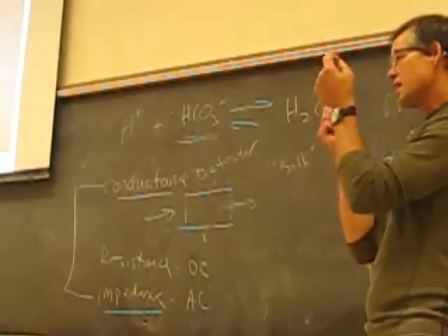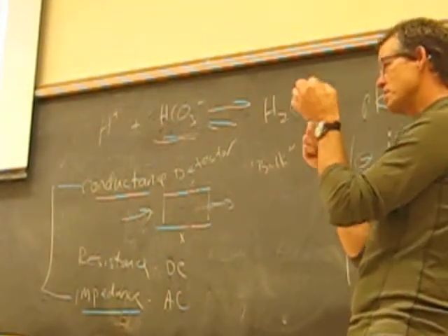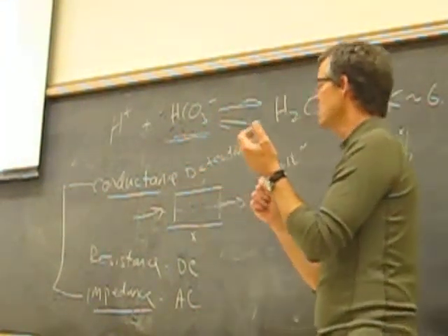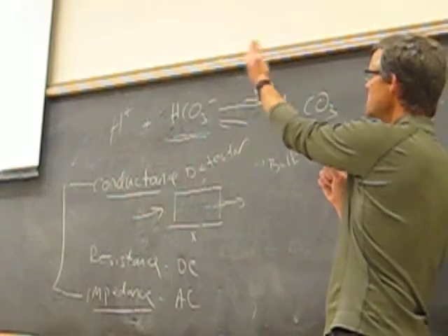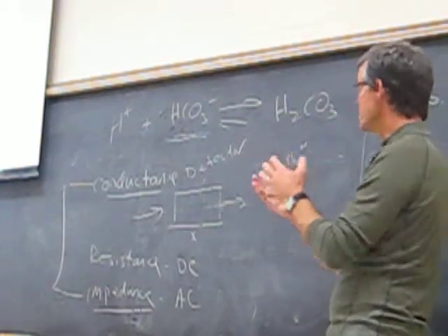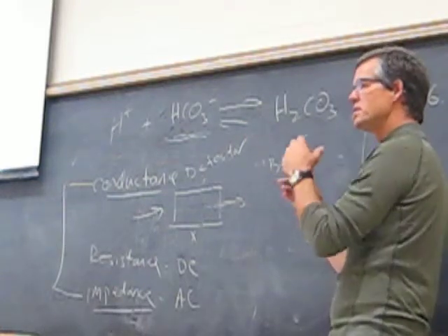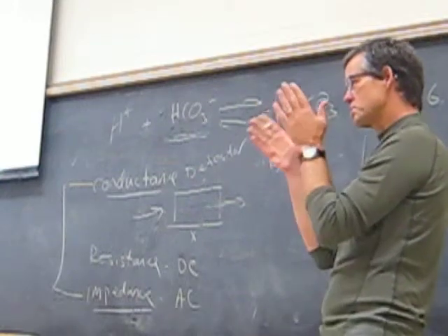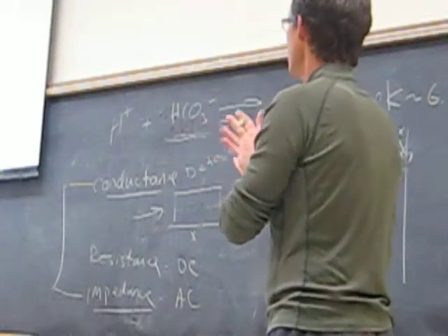The one caveat with chromatographic methods is that they're really specific to the column, because all the action happens on the column, and there's a lot of chemistry and black magic that happens there that sometimes can't be easily explained by chemical theory. And so some of these methods are developed empirically, meaning we try this and we modify this, and we modify the mobile phase and a number of things to facilitate a very specific application of separating specific kinds of compounds.